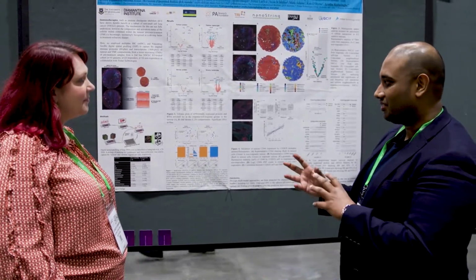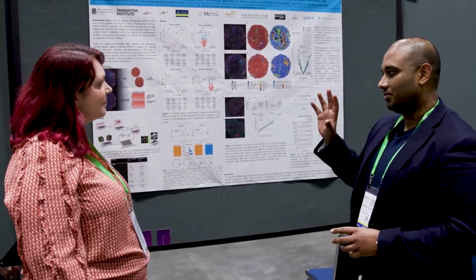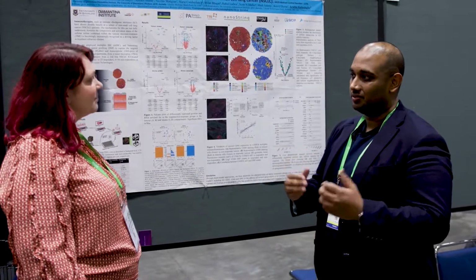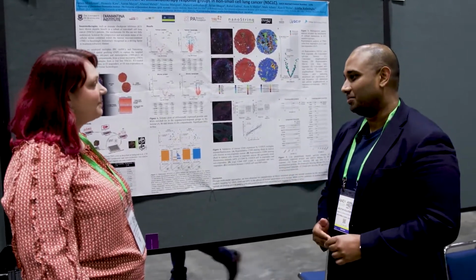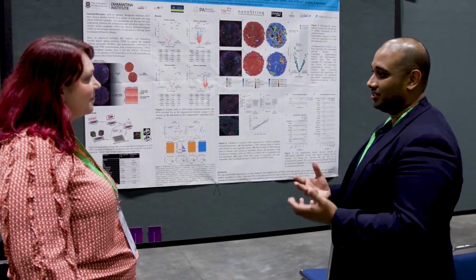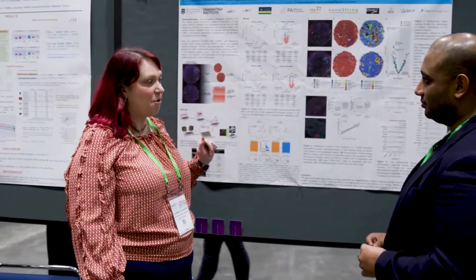We had a really great cohort of 90 lung cancer patients retrospectively collected, 45 of which were given immunotherapy and 45 standard of care. We had really good survival data for these patients, so which patients responded and those that didn't respond to immunotherapy. And we were able to apply spatial to those to delineate signatures associated with response and resistance to immunotherapy. Excellent. I know that you use the GeoMx digital spatial profiler.